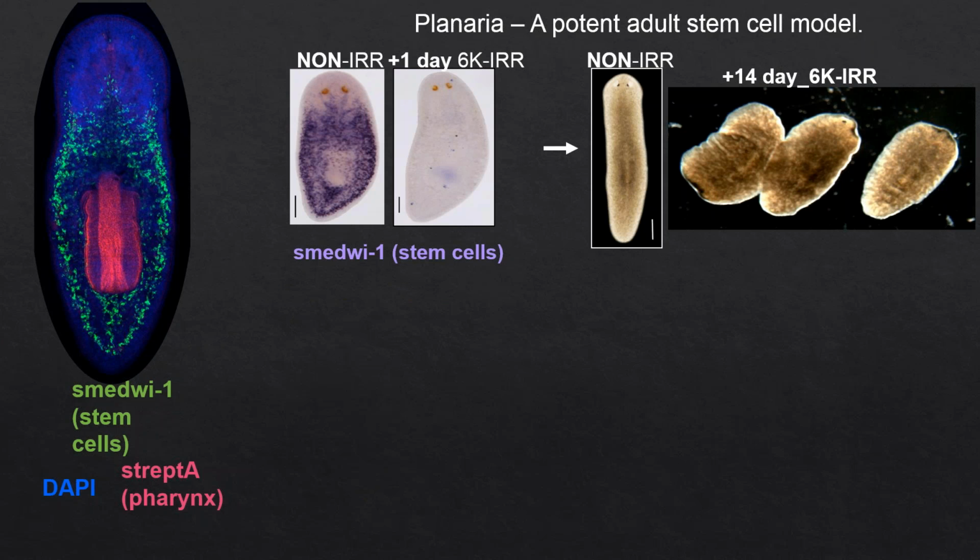again, it's an animal that lacks a lot of commercial reagents. There are some antibodies starting to come online, which is great, but certainly not very many yet, and not all of them work that well by flow. They've been using in situ hybridization a lot to assess gene expression. So we wanted to try and build, again, a cell type ontology and see if we can detect some of the changes in the animal that we know occur in response to some classical manipulations that have been done in the laboratory for several years now.